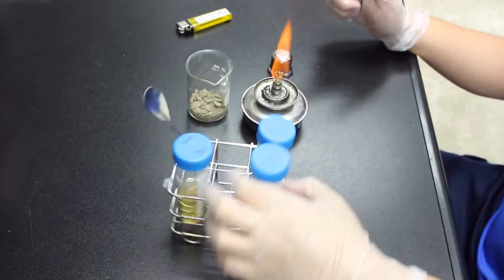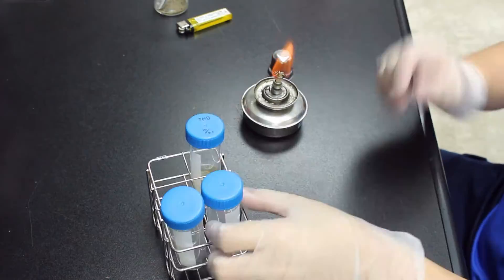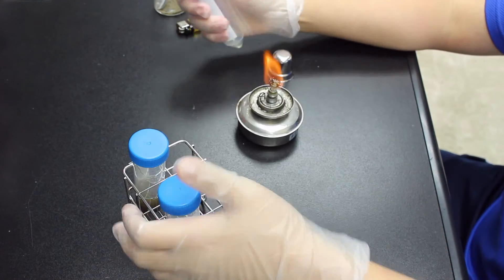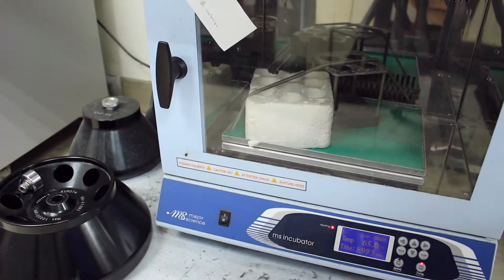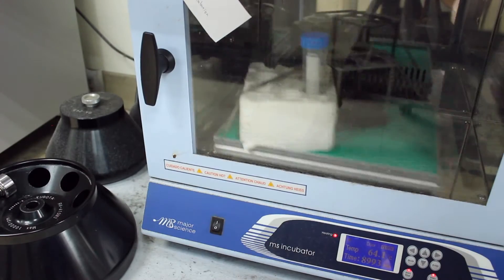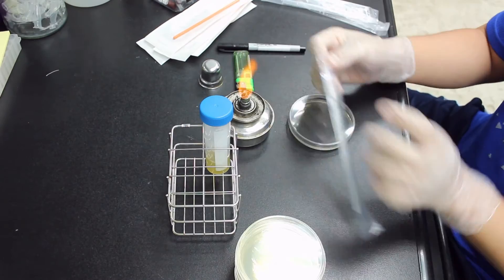After that, I add some growth medium and mix with the soil. Put the medium under 65 degrees Celsius or 149 degree Fahrenheit for four hours and then transfer them onto an agar plate, incubate for another 24 hours.